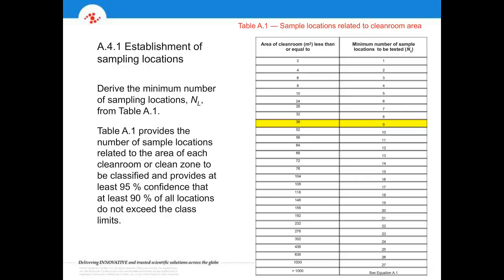And again, this is based on the need to try to get to a 95% confidence value for the determination. So again, a statistical method, we want high confidence. That's set to target a 95% confidence.